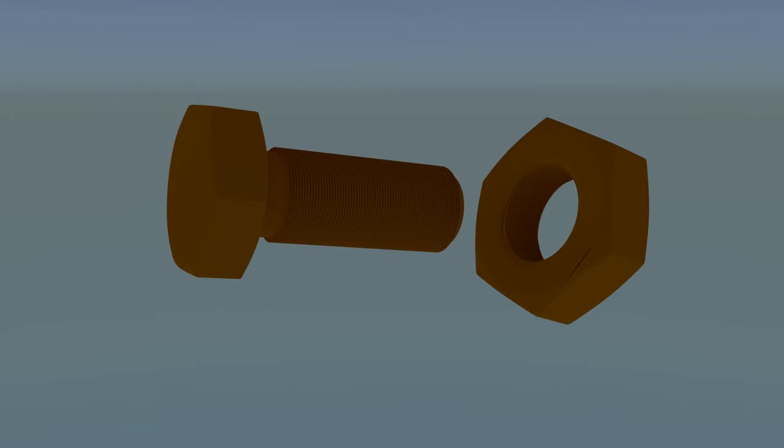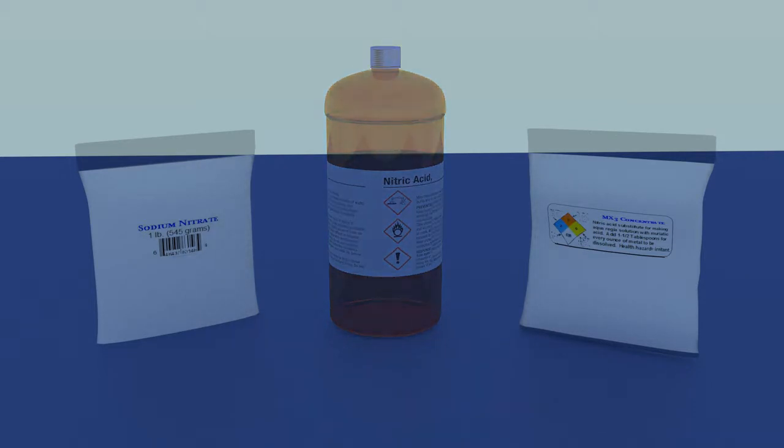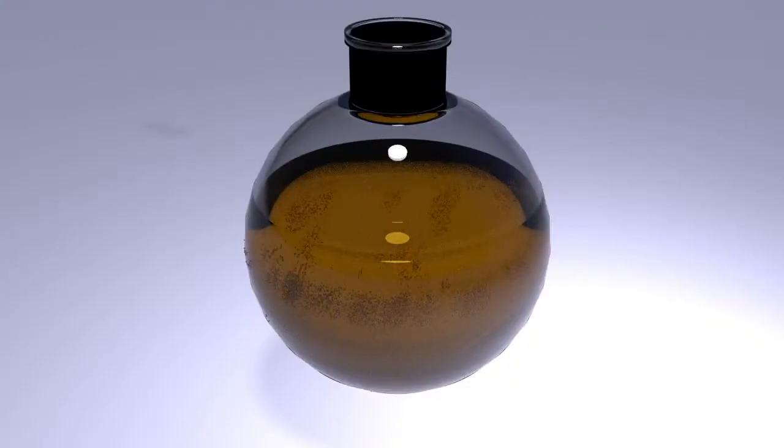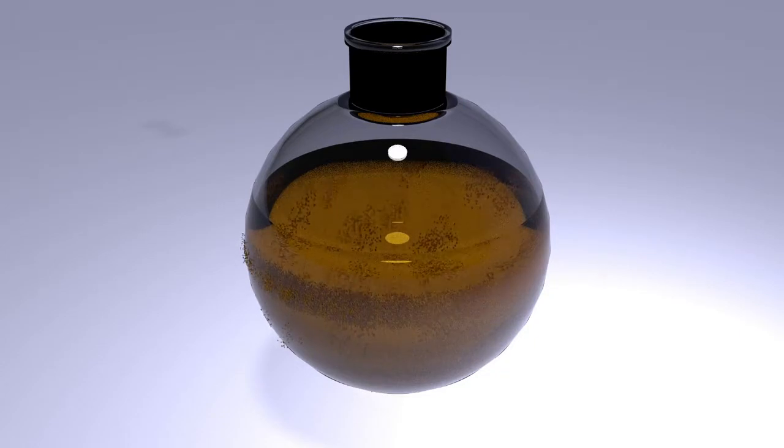In these instructions we will include the nitric acid version of aqua regia, but really there is no good reason to use nitric acid. It is dangerous, expensive, and difficult to obtain. The dry substitutes, either MX3 or sodium nitrate, are far safer, reasonably priced, and easily obtained. After the metal is dissolved into solution, the gold can then be selectively precipitated out of solution leaving all the other metals dissolved.